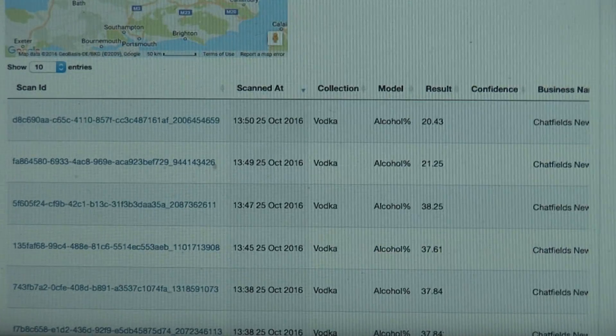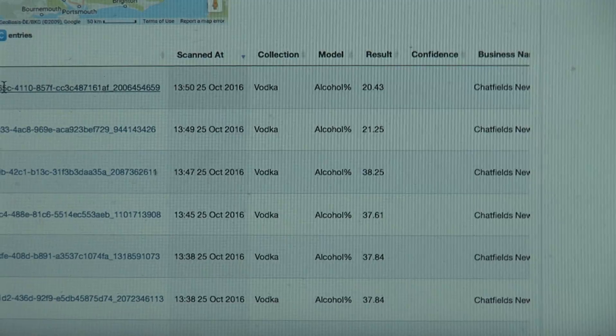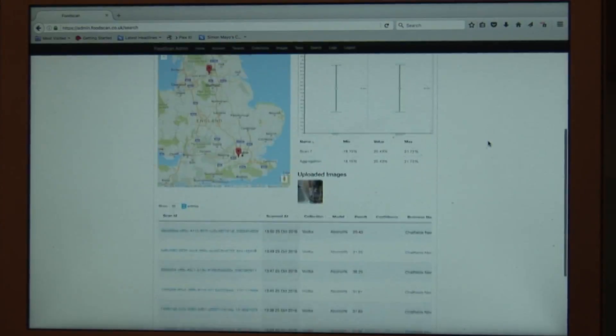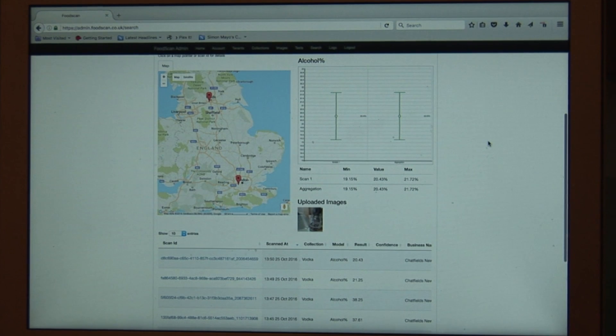The results have already been written to the cloud database, they're plotted onto a map, and you can have a look at the test that we have just taken and download the results for further analysis.